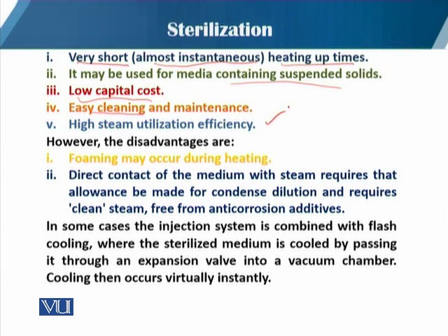However, in this case, there are disadvantages. The first one is that foaming may occur during the heating. When there is steam and you are directly blowing it into the medium, there is excess foaming. Also, if we give the medium direct contact with the steam, there will be condensation, so allowance must be made for dilution of the medium.